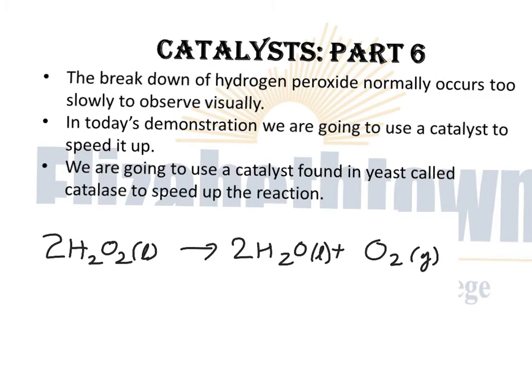Yeast, the type you cook with in the store, actually contains a catalyst that speeds up the reaction. The catalyst found in yeast is actually an enzyme named catalase.